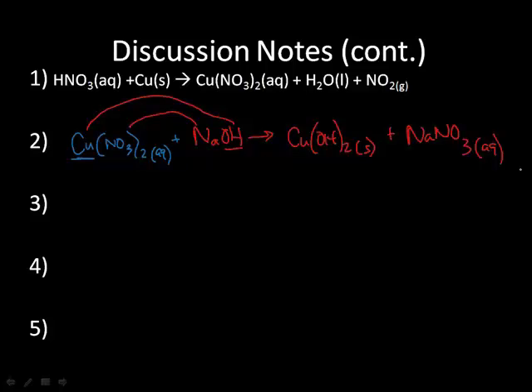Then once we made that copper hydroxide, we heated it up. Now if you heat up something that has a solution, it's got copper hydroxide, what did you notice coming off of the beaker when you heated it? Some of you may have seen that the substance in the beaker changed color, but there was also some steam coming off. Steam is liquid water that is condensing because the warm gaseous water hits the cold air and condenses into little droplets. The copper hydroxide, when it's heated, you're removing water.